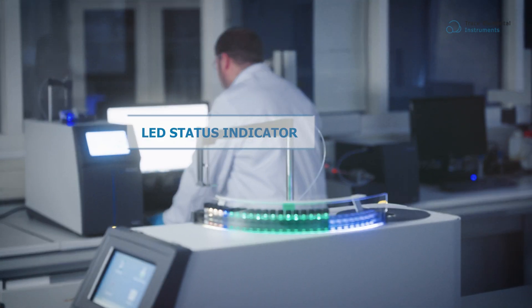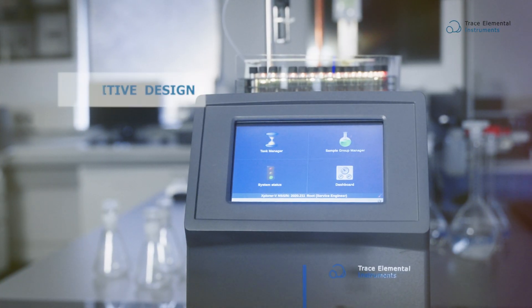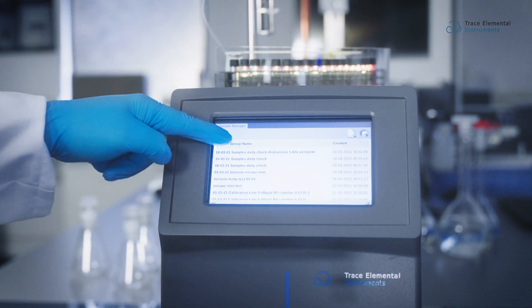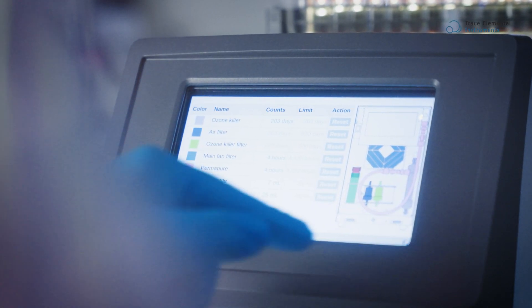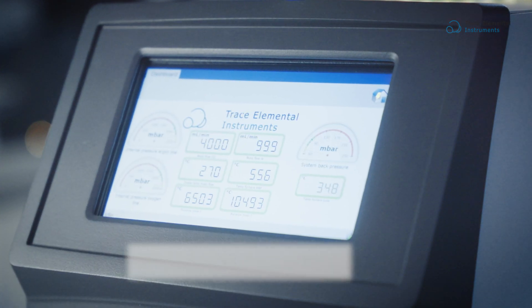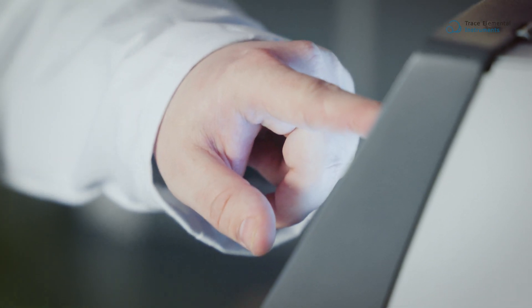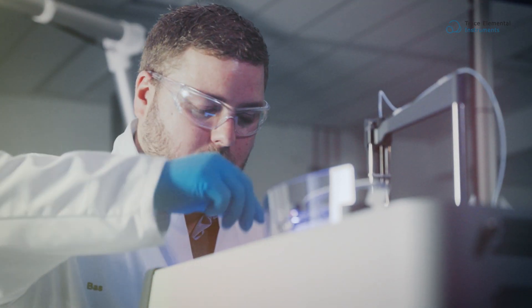Operators can clearly see where to put their samples. The integrated touch screen shows an overview of important functions like sample information, analyzer status, and consumable usage. Together with an easy start and stop functionality and a parameter dashboard, you have all important information and functionality accessible in just one click, all to ensure your uptime.